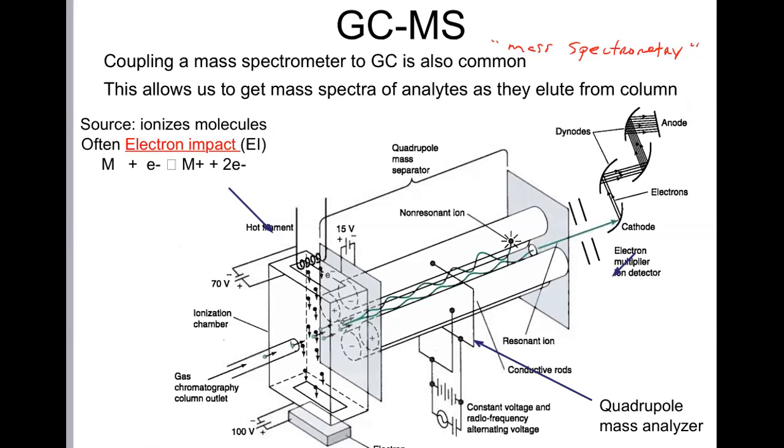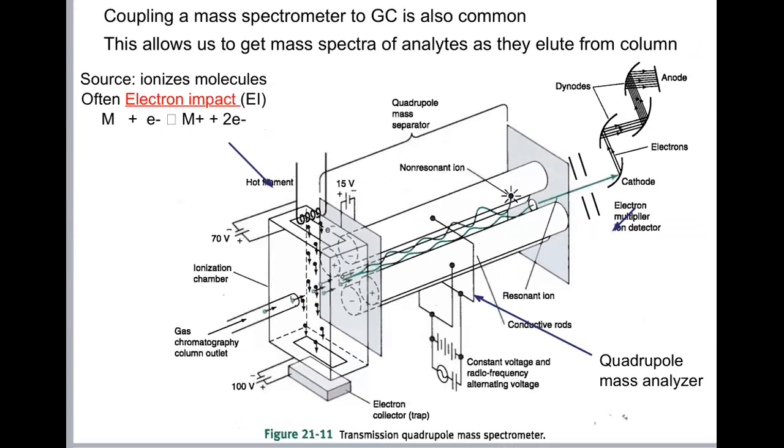Now, it may set you back, I don't know, maybe a better part of $100,000 to buy one of these. But the data that you get from it is really unparalleled in terms of ability to do qualitative analysis, to understand what the materials were. And oftentimes, if people get arrested for having drugs or blood doping in the Olympics or something like that, using banned substances, they will need to confirm the presence of that illicit substance. They're using GCMS methods, and the reason why is because it is kind of the gold standard. If you get a signal by GCMS that corresponds to that illicit substance, it really probably is. There's not a whole lot of tricking these devices, okay? So let's talk about GCMS, how it works, and really what it does, because it's a little bit complicated, but it's not anything that we cannot understand.